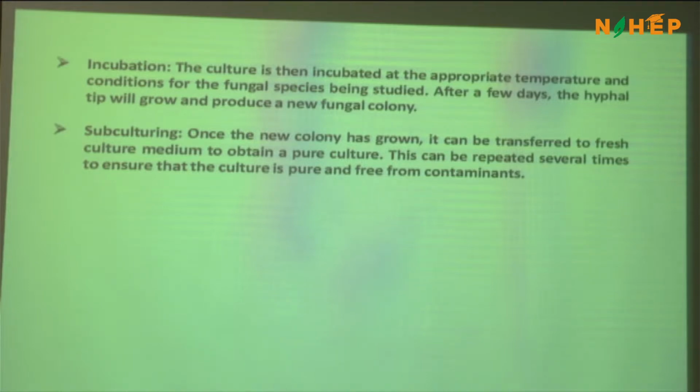In agitation mode, I do not know how many have experience growing fungus in agitation mode. You get fungal balls, right? So how many of you have experienced it? Yeah, you get tiny, small bubble-like fungal balls. They are the ideal material for DNA isolation, right?